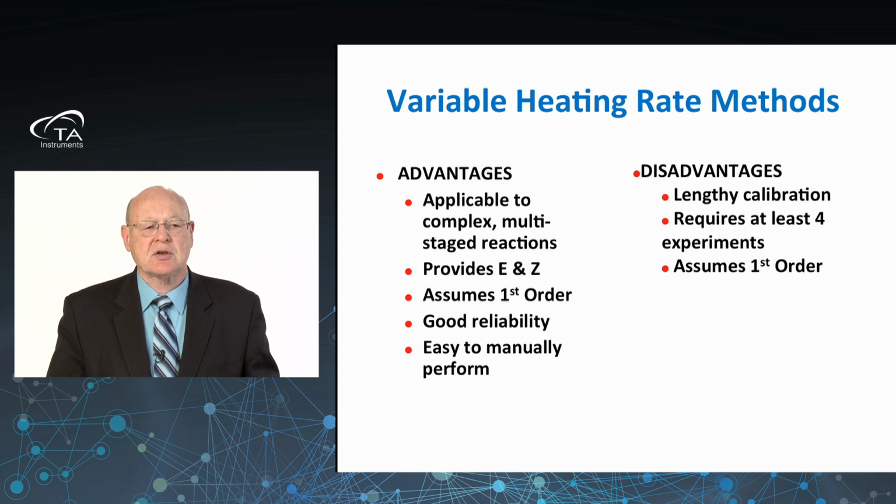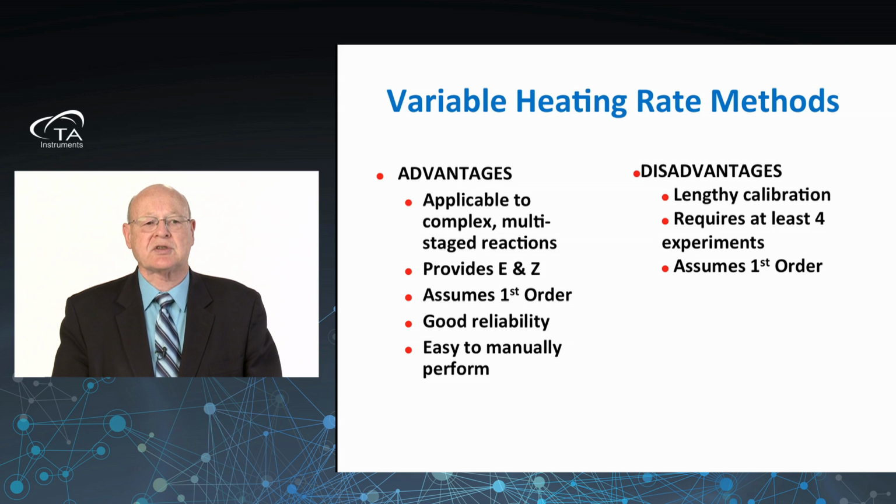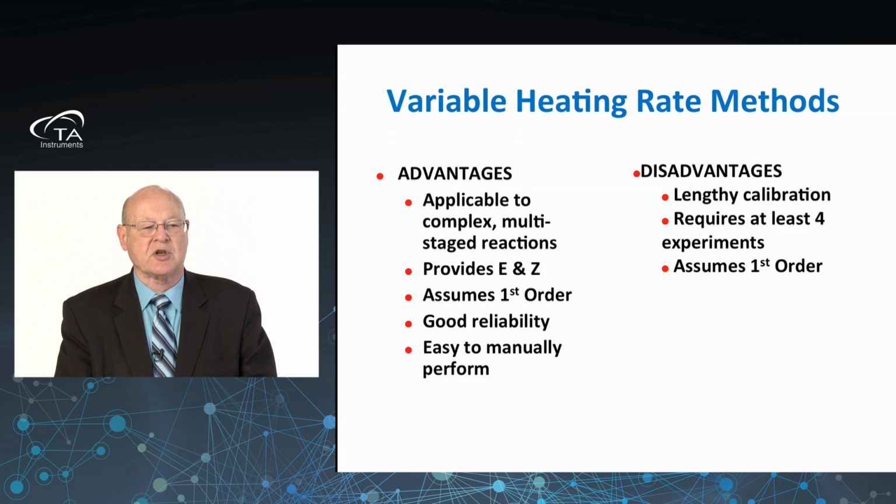Now, this issue of the number of experiments that one needs to run produces the disadvantage that it takes a while to perform this test. Typically, to gather all the experimental data is about 2 days worth of experimental time, because some of the experiments have to go at very low heating rates, about 1 degree C per minute. Those take time, and we're covering hundreds of degrees, so it takes some time for those curves to be generated.